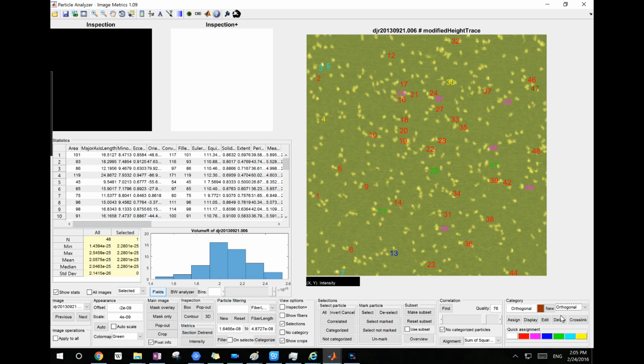I think it'd be good if I can do this. Let's say the first category, which is double. Let's click double, say display. This should only display the particles that are red. Apparently the display function is still broken.